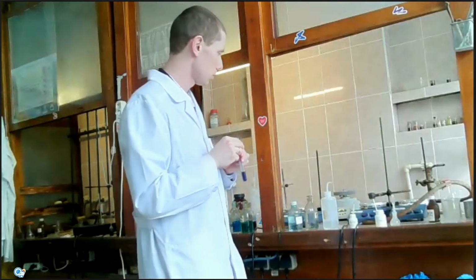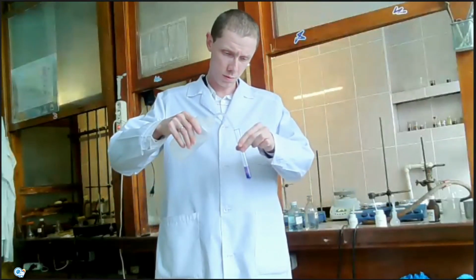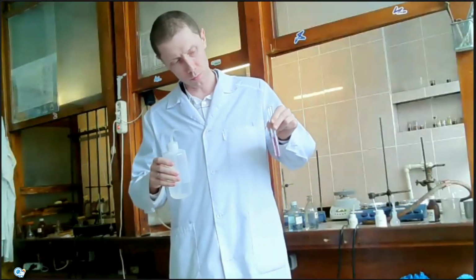But also, like we experimented with ammonium thiocyanate, if I add water, color changes to the color of cobalt sulfate.